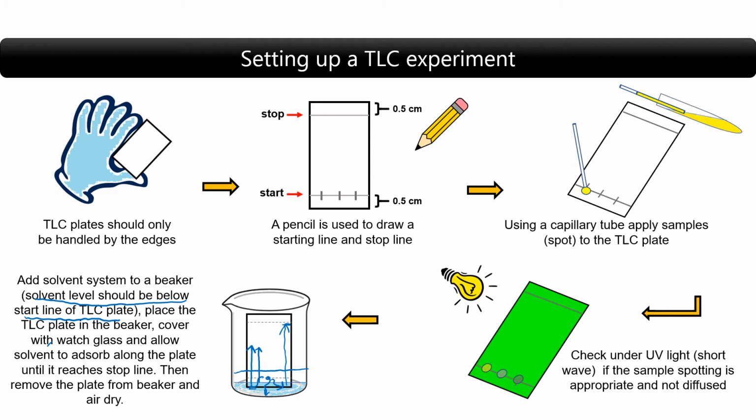and we will use tweezers to pick up this plate out of the solvent.